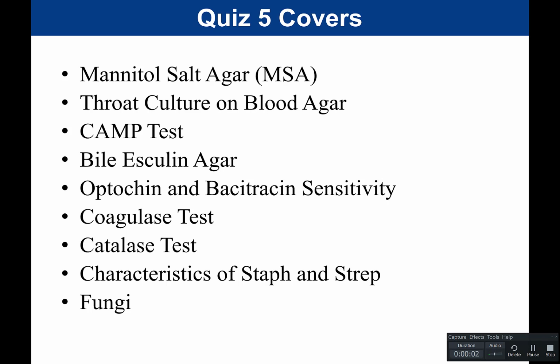So in this video, I'm going to review what you need to study for Quiz 5. The majority of Quiz 5 is all things related to staph and strep. That includes the Mannitol salt agar, the throat culture on blood agar, CAMP test, Bile Esculin agar, Optochin and bacitracin sensitivity, coagulase, catalase, and general characteristics of staph and strep.